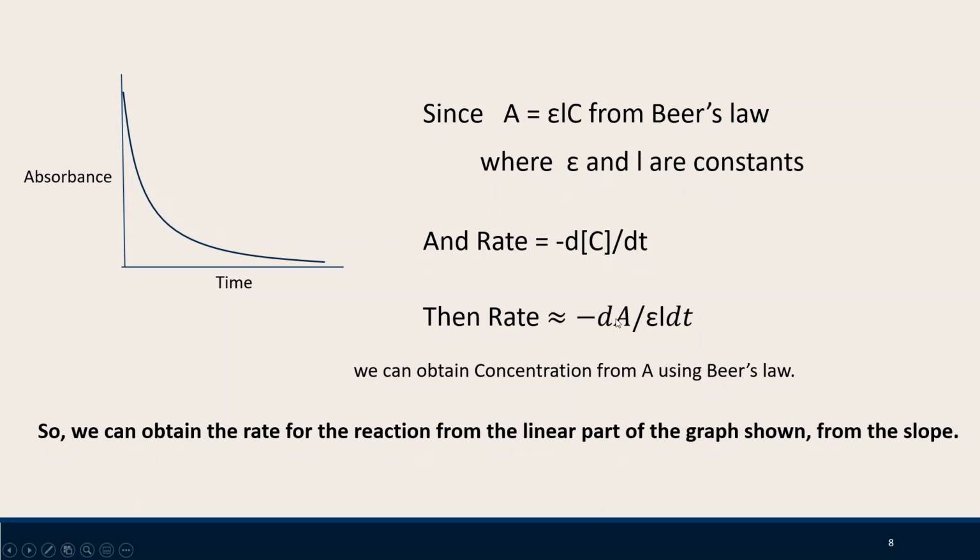I give you absorbance versus time. If you make a plot and you get a curve that looks like that, currently the initial part here looks linear, but can you decide, are you going to use only this part, or maybe a little more, that part?